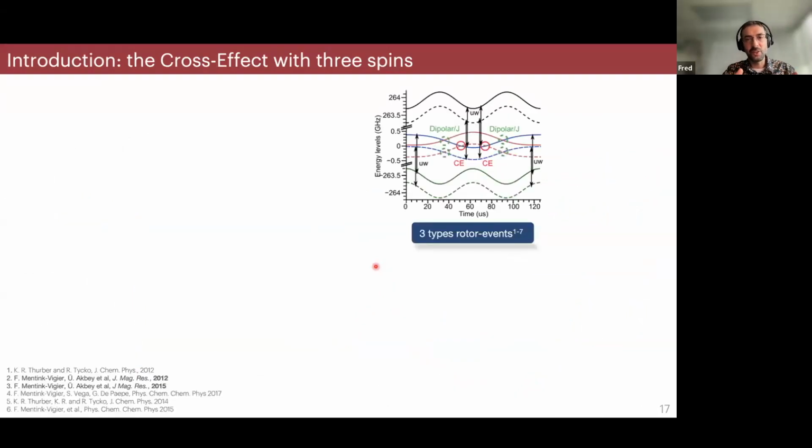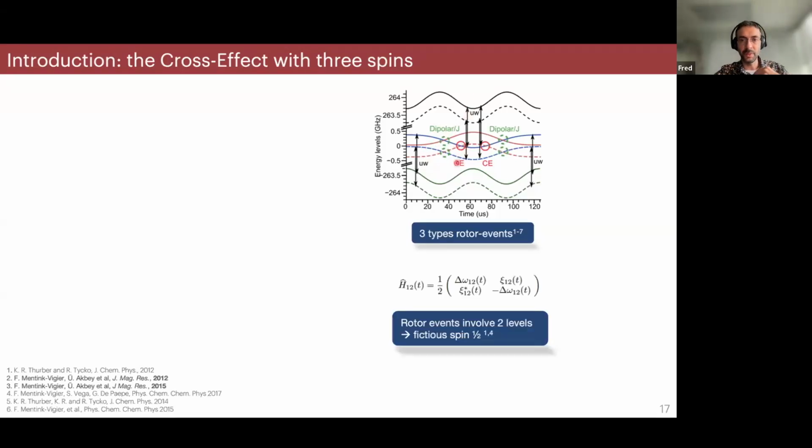And actually, now we can go into this diagram a little more. If we look at these energy level diagrams, there are multiple conditions where the microwave can be on resonance with an electron spin, or you can have energy level crossings or anti-crossings if I want to be rigorous. So those energy level crossings and anti-crossings, on top of on resonance, are critical for the DNP. You can look at these energy levels as a fictitious spin 1/2 when they cross.